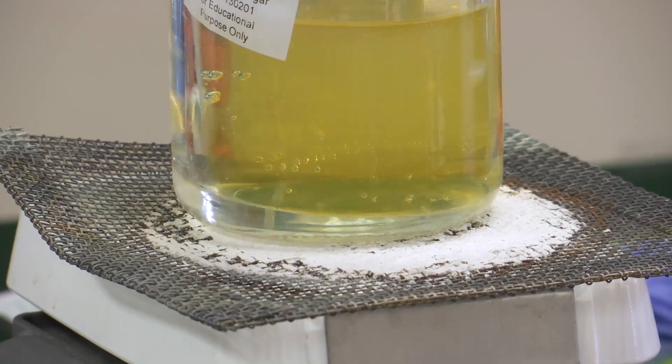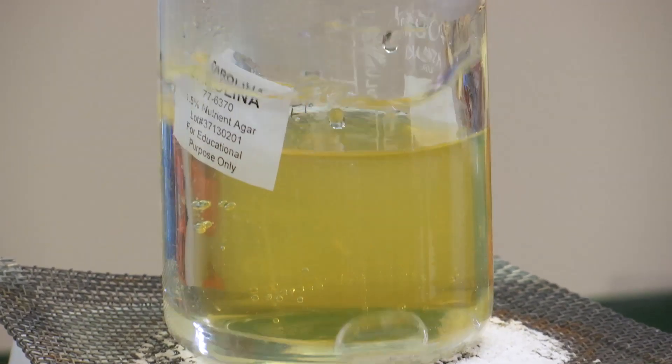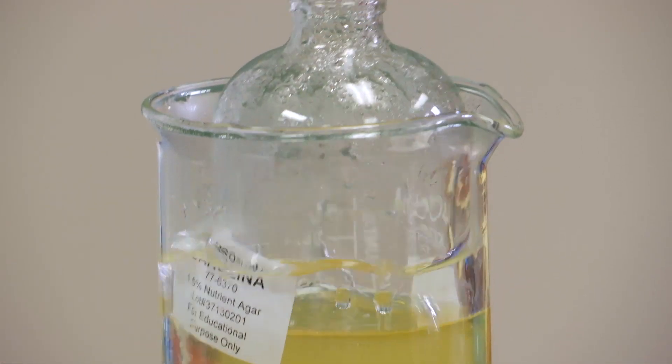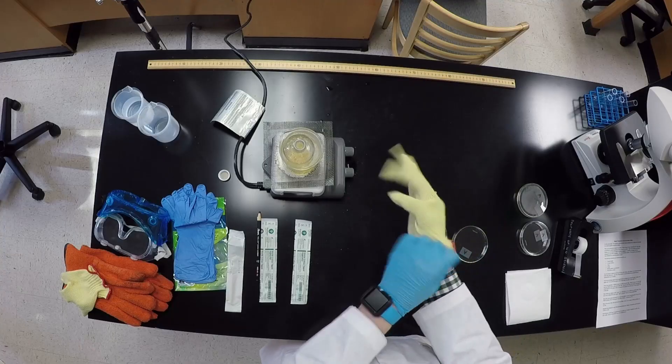Heat some boiling water up in an appropriate container and place the agar bottle in the glass with the lid off. Be careful not to submerge the bottle or get water inside of it. Once fully liquified, carefully take the bottle out with a glove. It will be hot.